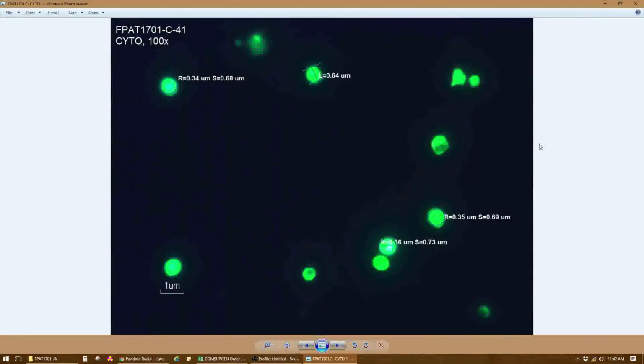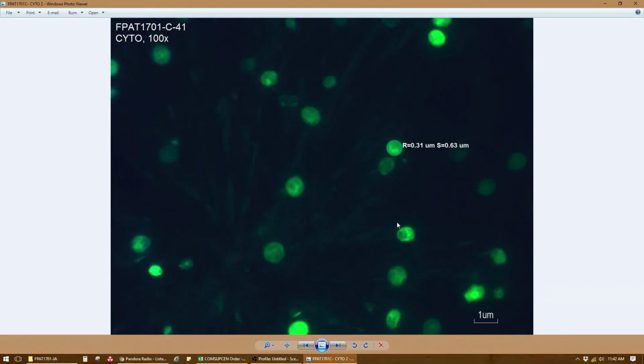This is an example of the circle from 3 points annotations to show general measurements of objects in this Cyto BC image and representative micrometer scale.